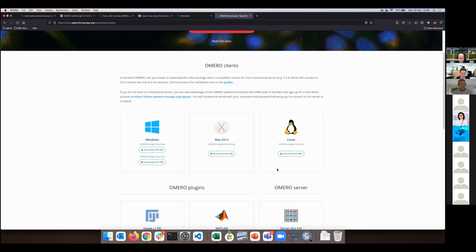After I downloaded and installed the application, as I said, the installation is indeed trivial. Okay, it's very trivial. It's almost as easy as when you install Fiji, which is basically just 2 clicks. And you will nonetheless require to have Java installed on your machine.